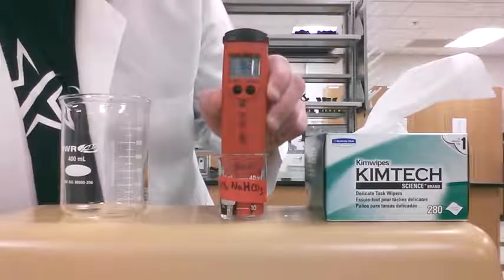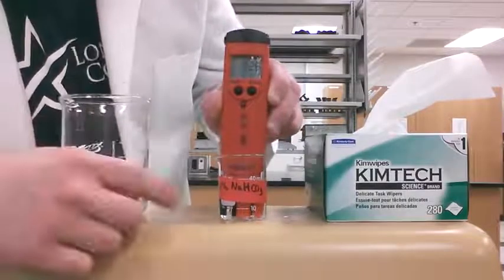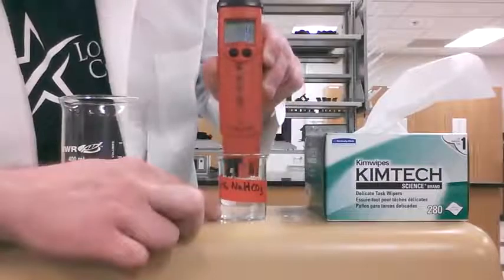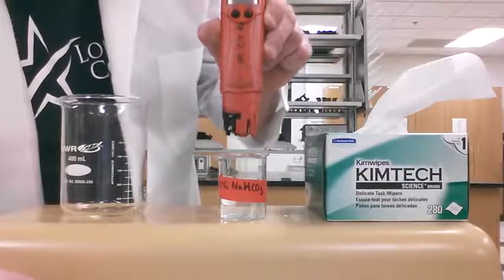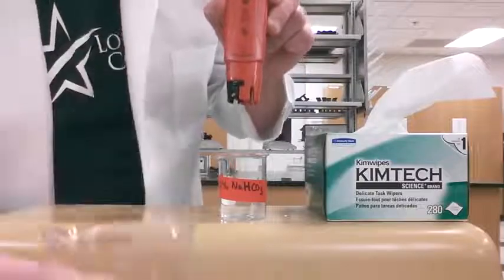Anytime that you're going to change solutions or put the cap back onto the pH meter, we're going to have to rinse the electrode. We don't want to keep any of the things that are inside the solution you're measuring on the electrode, because that's going to wear it down and make it so we can't use it in the future.